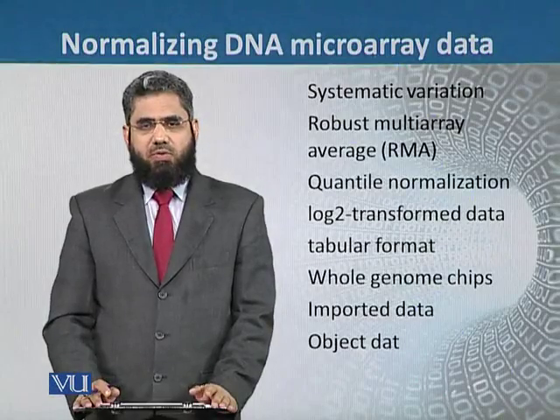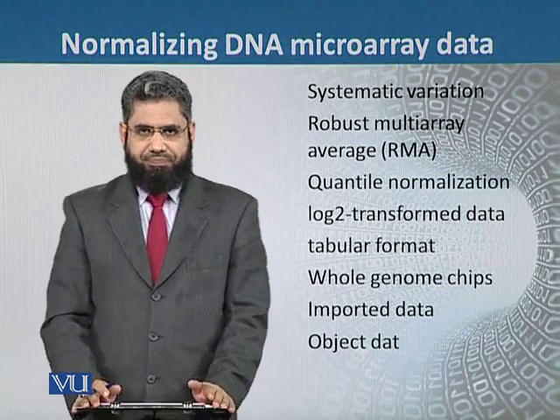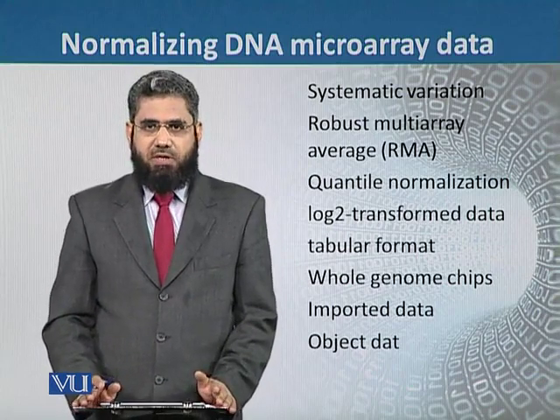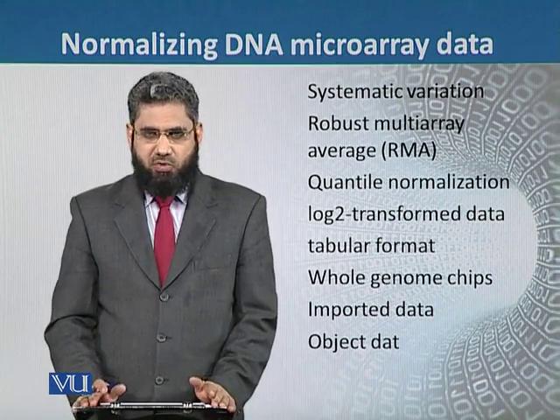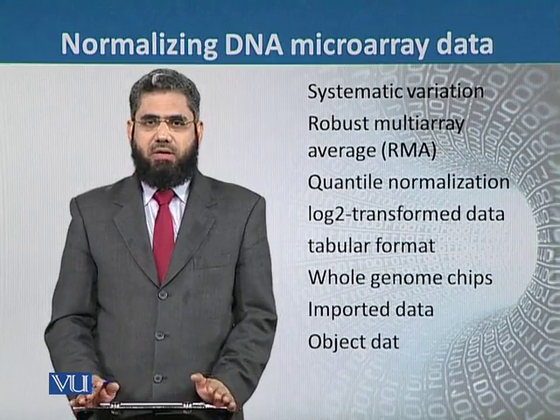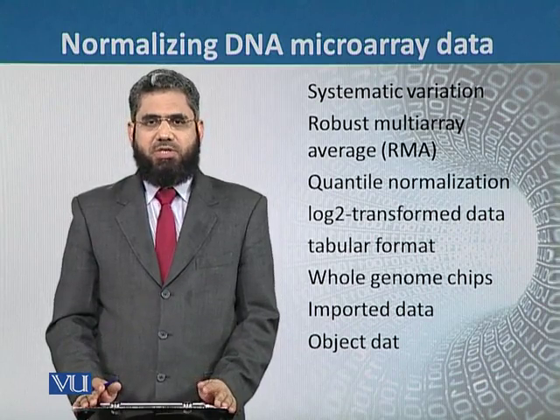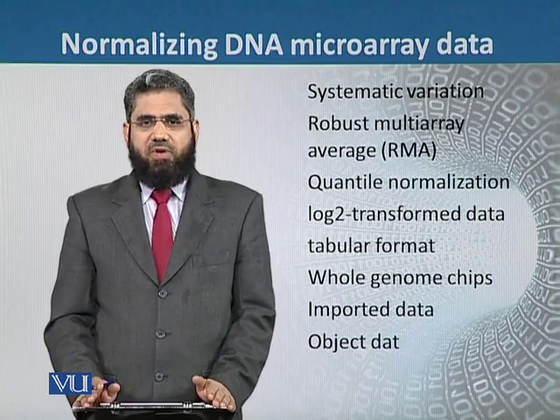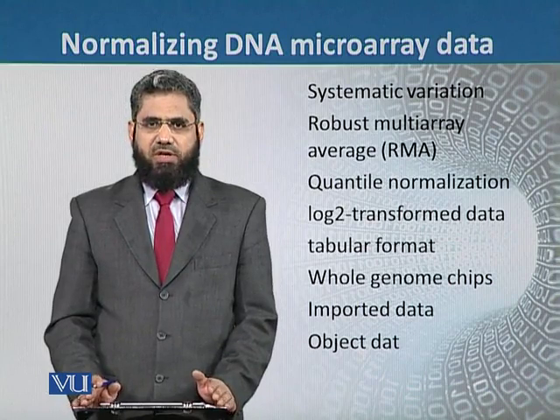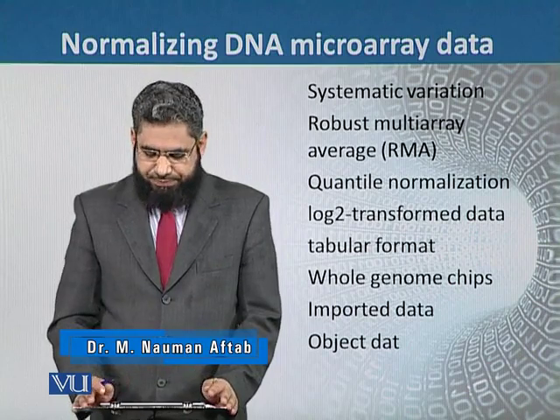Now we'll see how we will do the normalization of the data that we have imported in the R program. So normalization is basically the set of commands or the methods or protocol used to remove the systematic variation within the microarray data. In other words, we can say normalization is a process by which we can make the microarray data compatible within the different types of data of the different companies.